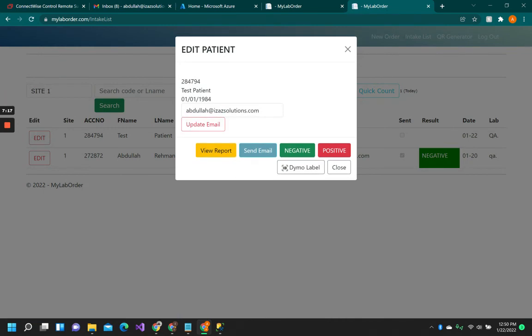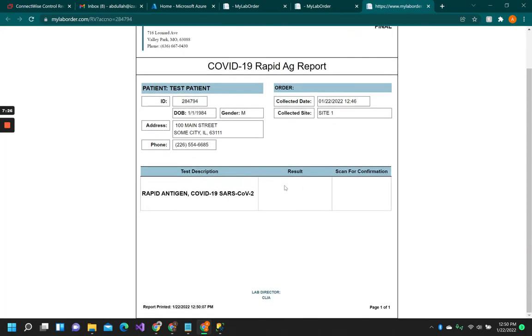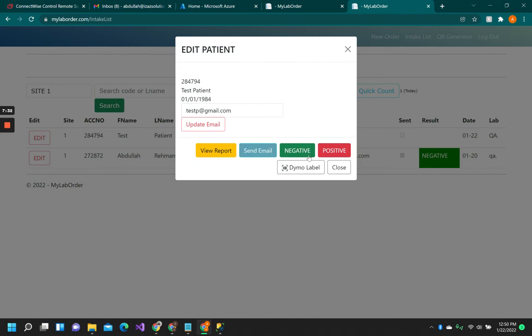Okay, the email has now been updated. We can simply review the report. We'll see that there is no result at this time because we have not resulted it. Okay, and then we can choose to result them.